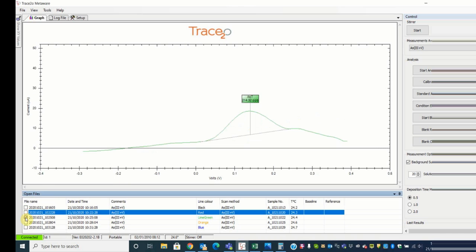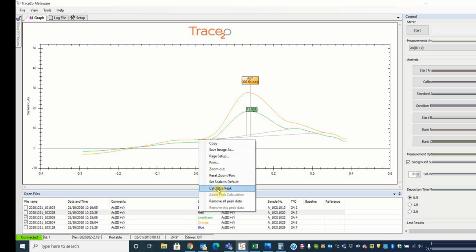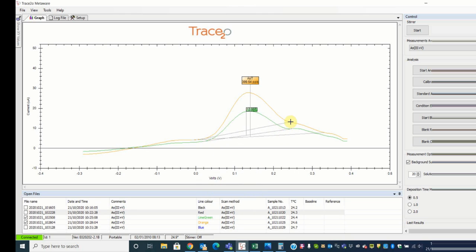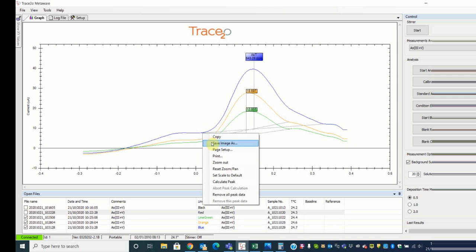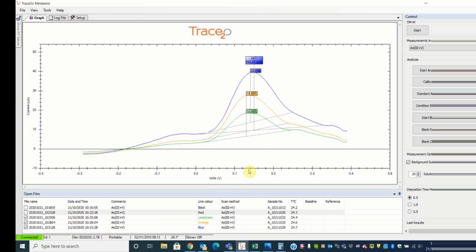For the arsenometer specifically, it should be noted that the peak heights are generally calculated from one area to the next, and then the line for your base should go to a similar area on the next peak. You will notice as your concentration increases, the area to which you should drag this baseline becomes harder to detect. However, the baseline should always be of a similar width.